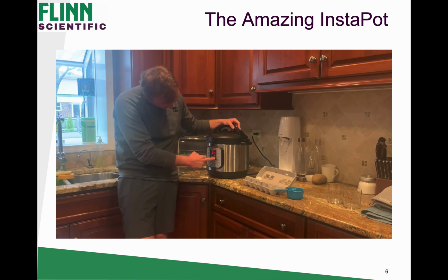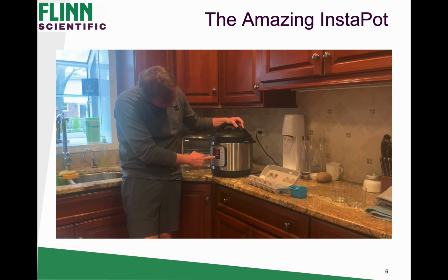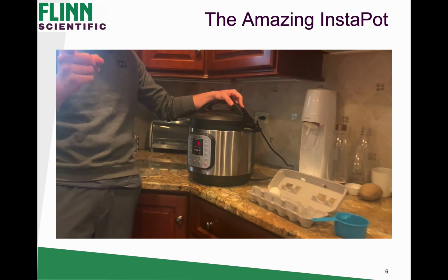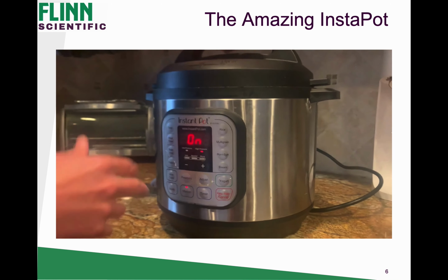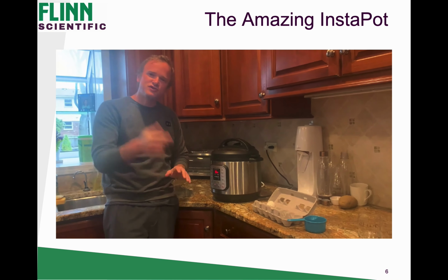And this is going to take 5 minutes. Notice the little high pressure button is lit up there. Maybe you can't see that, but high pressure. That's going to be important. Cameraman's getting in closer. And we are going to hit, no, I think it started automatically. So we're good. Now, 5 minutes, we'll check back.